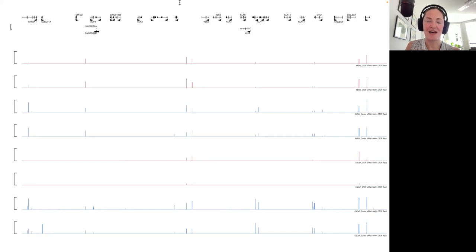All right, so I did mention the Kallikrein set of loci. We've got KLK3, which we know is really important for cancer detection. But really cool, we're seeing these results validated that we saw in that schematic. So this particular site here is between the KLK, I want to say KLK4 and 5. And this set of peaks is attaching to this set of peaks here on the far right.